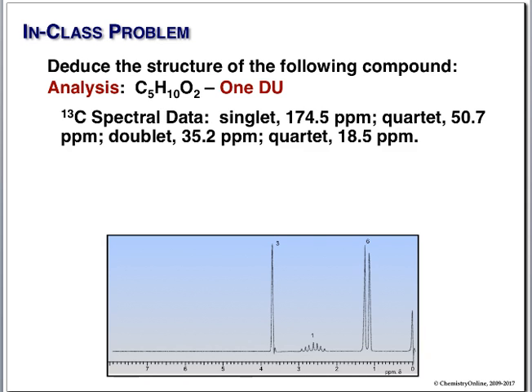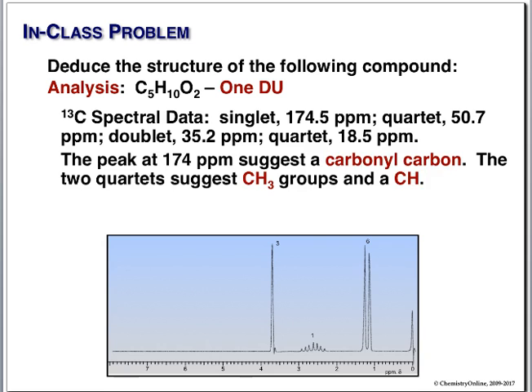It's not an aldehyde or a ketone, probably an ester. We have a quartet, that's a CH3, a CH, and another CH3. Carbonyl carbon, CH3 groups, and a CH.